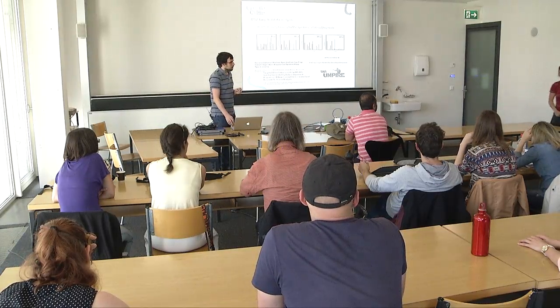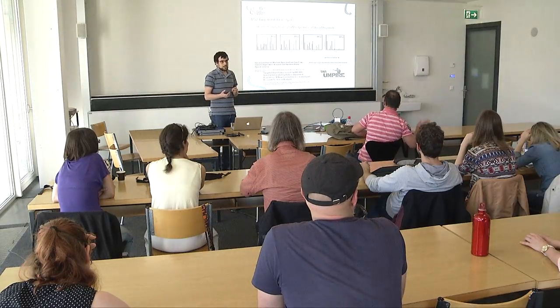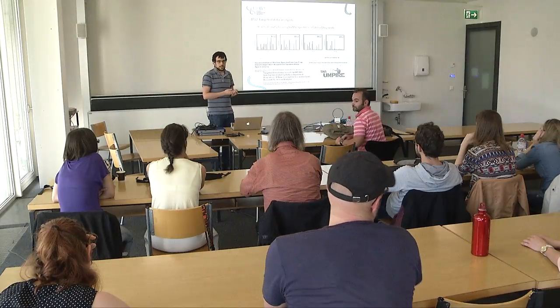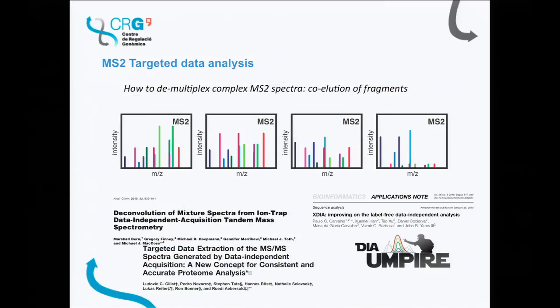And so during the course and also in different proteomics forums, the question that arises here is: is data-independent acquisition a targeted mode, or is it a shotgun mode? Right?